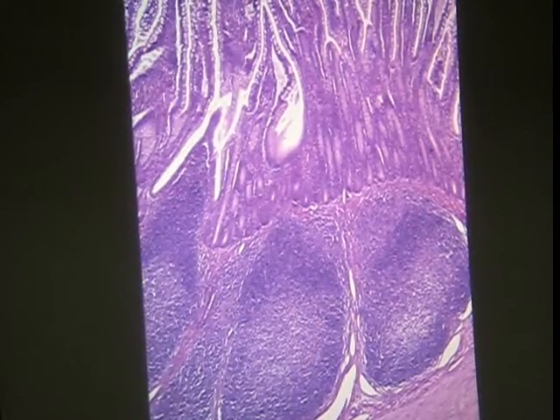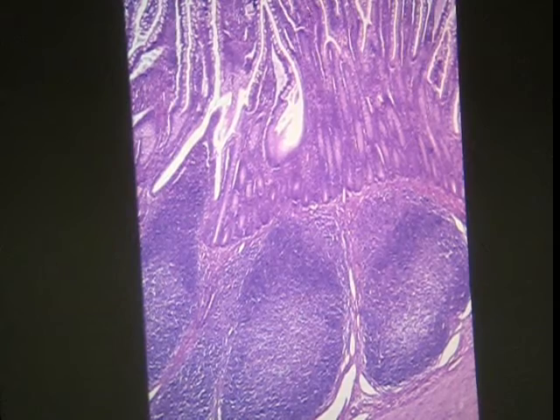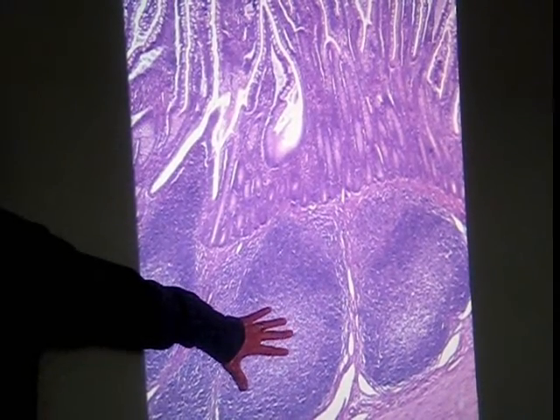Your old friend, you either love or hate the slide. Clearly we've got Peyer's patch.